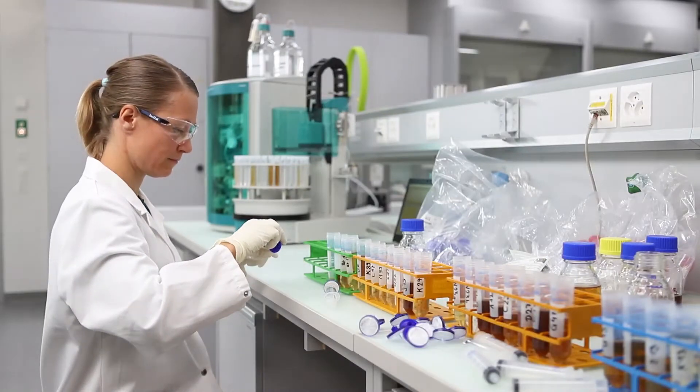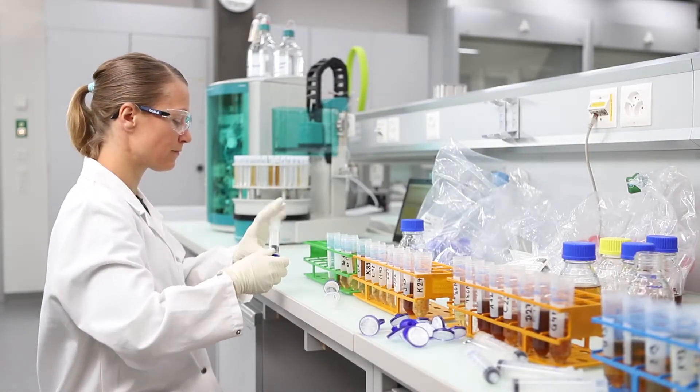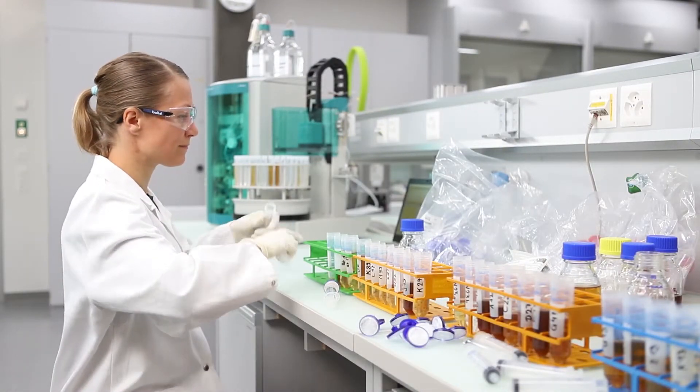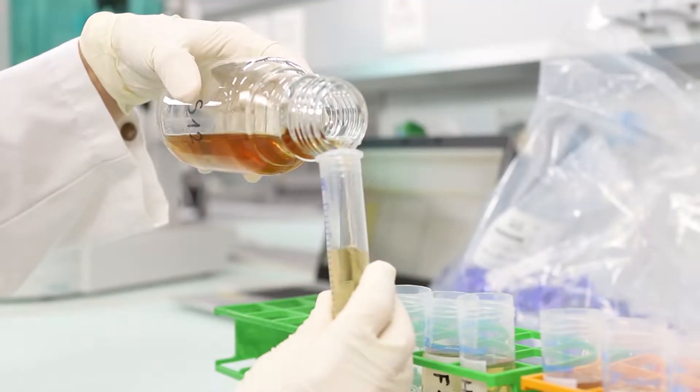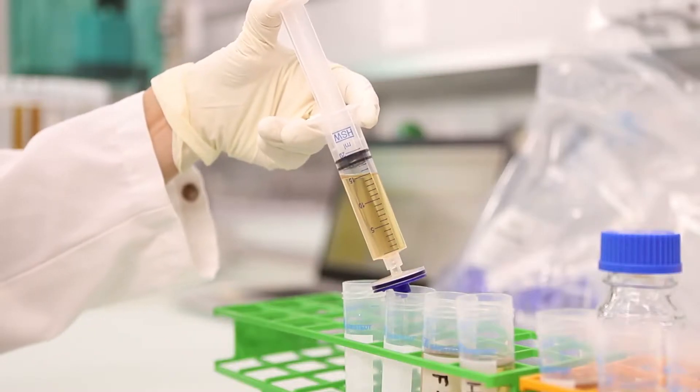But manual filtration means a lot of work, as well as high costs for single-use filters, additional vials, and disposable syringes. It also generates a lot of waste.